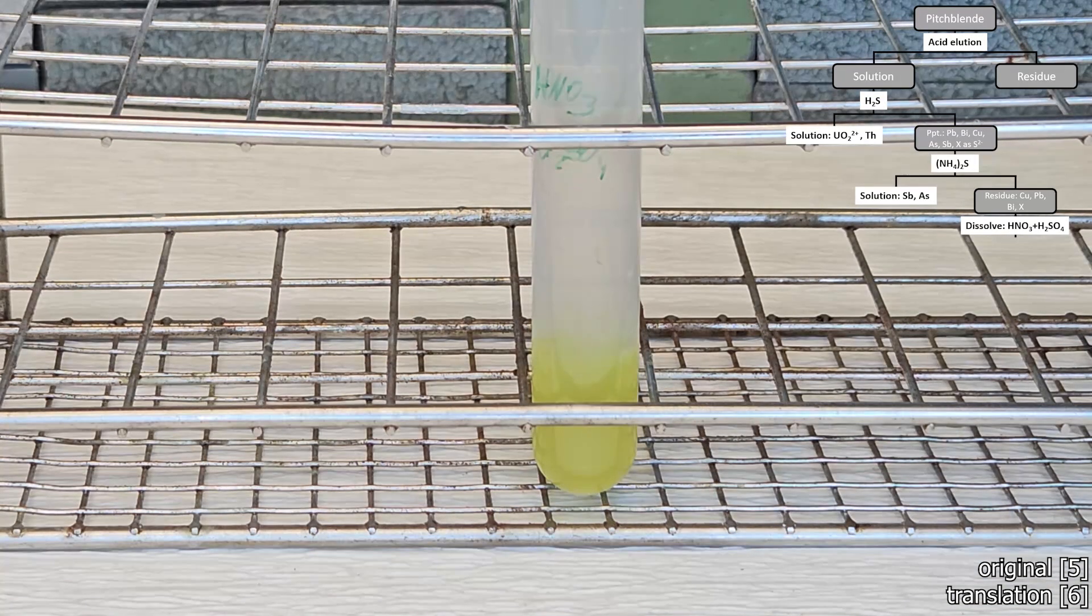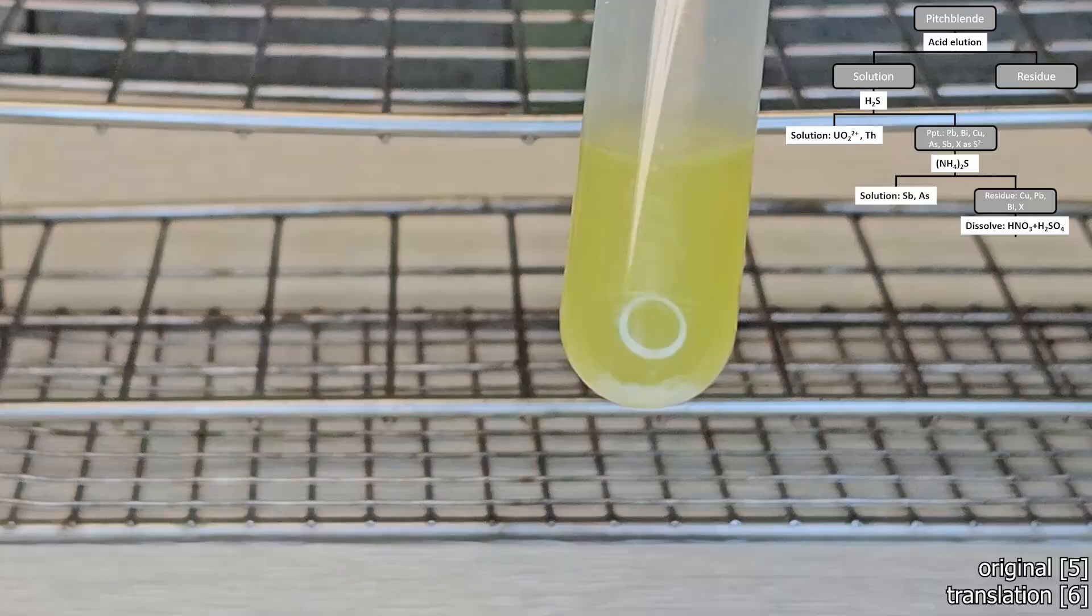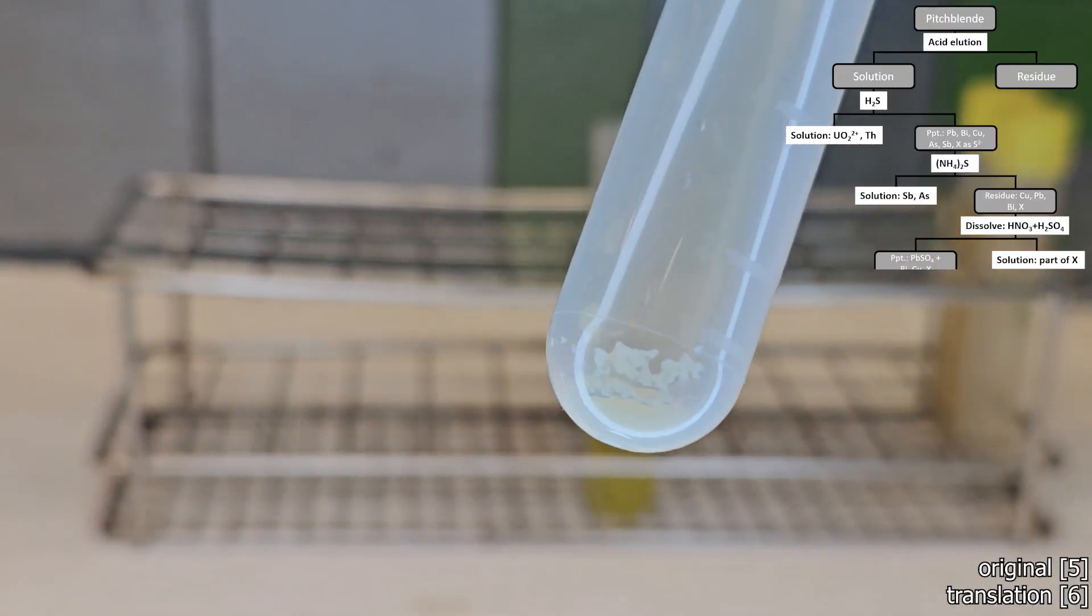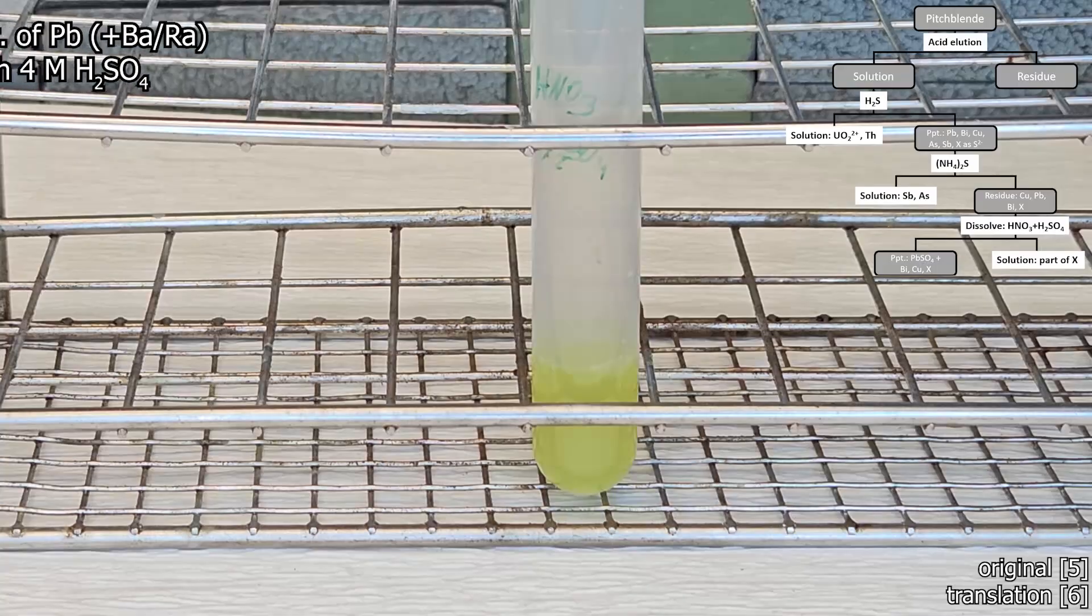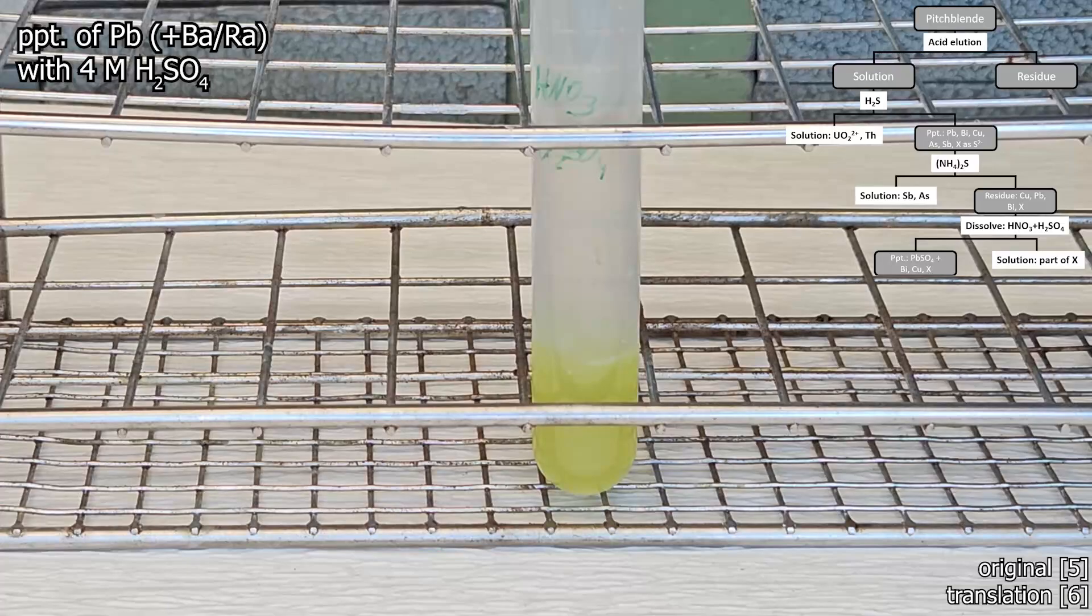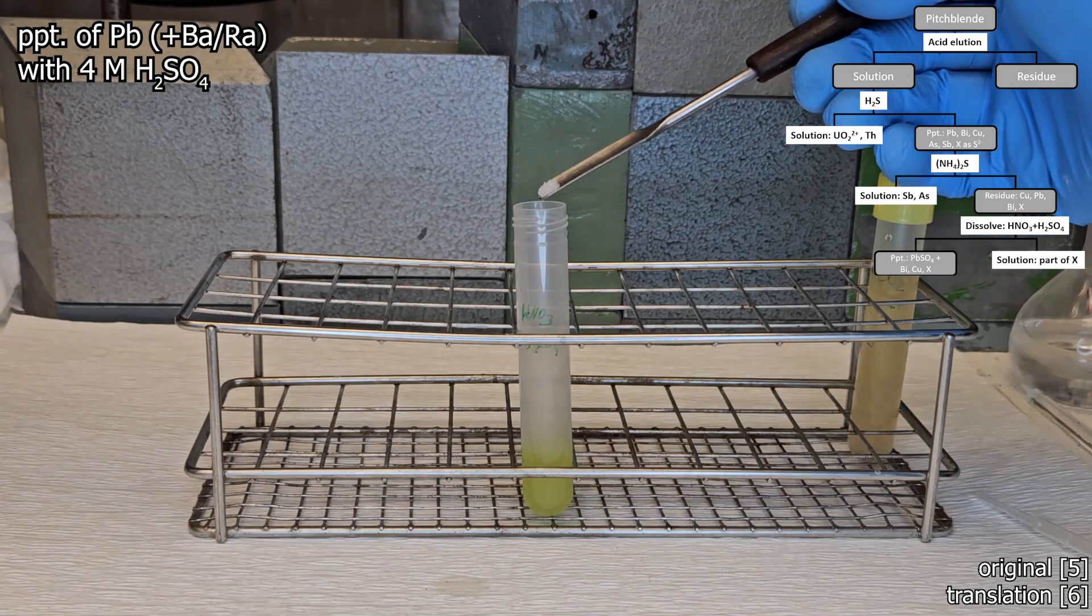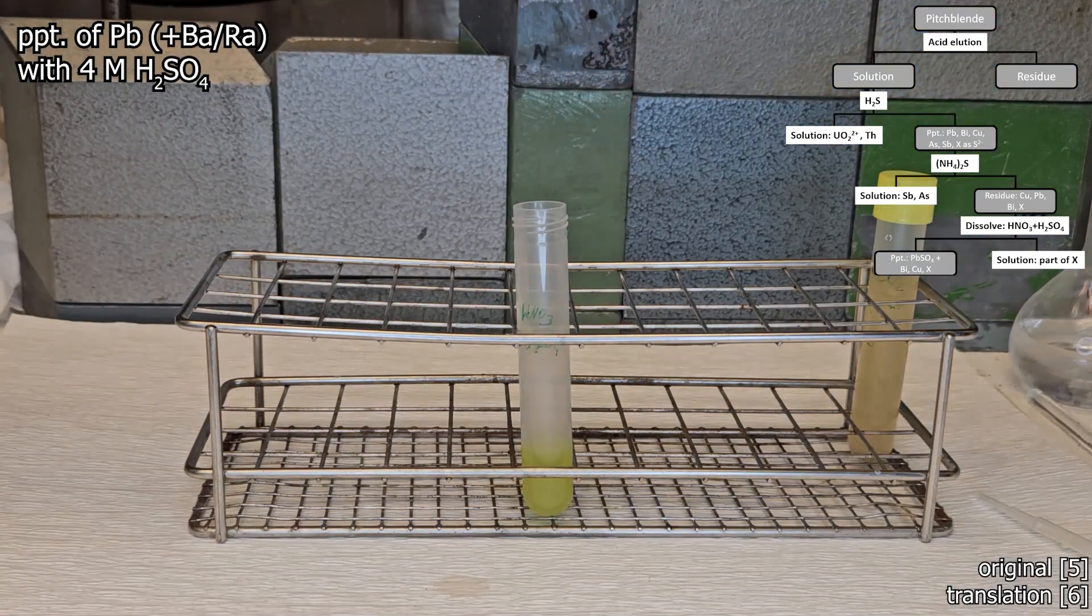The somewhat clear solution contains the dissolved polonium and is mixed with 4 molar sulfuric acid, primarily to precipitate out the lead carrier. The first sulfate precipitate is the mass from which Curie later extracted the radium, as radium and barium also precipitate out here.